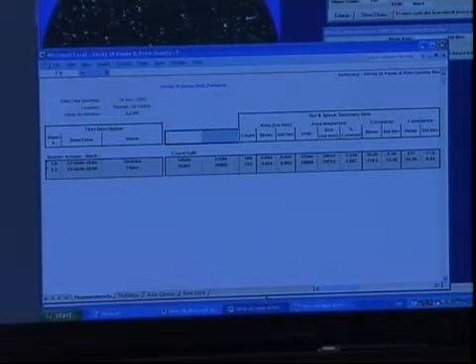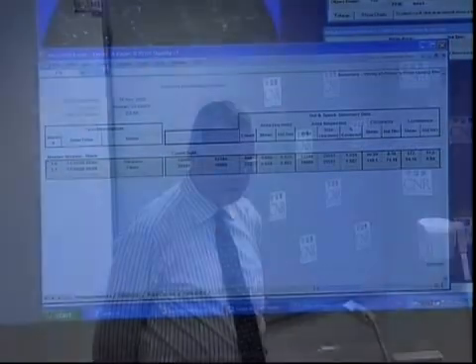We've demonstrated everything in the laboratory of the typical recycle processing mill. We've showed you how to do the process calculations for the dirt content, watching it everywhere from the pulper on through to the finished product. You can monitor the amount and quality of the dirt, and then you can also measure TAPPI 563 if you're shipping or selling the product to another mill. And that pretty much concludes our laboratory. Thank you very much.